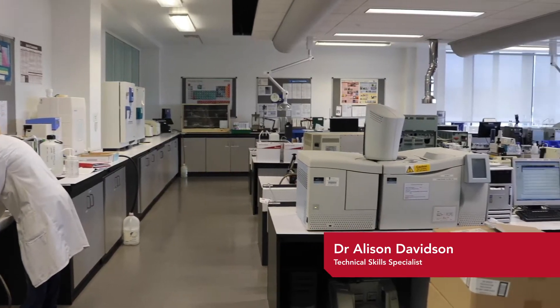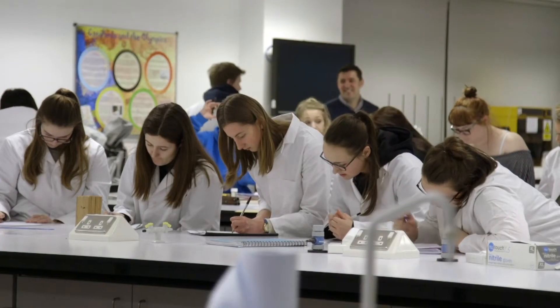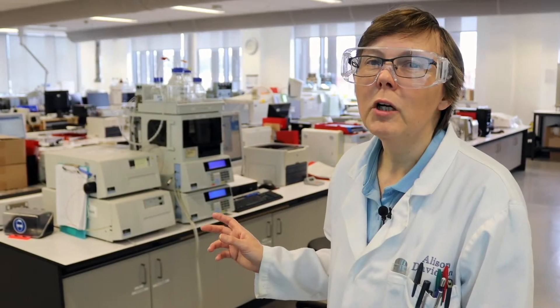Hi, I'm Dr. Alison Davidson. Welcome to our analytical methods laboratory. This laboratory is here for all our students at the University, but is especially used by our forensic science students. Let me show you some of the equipment that we've got in here — this is equipment that we'll get you working on right from your first year and even your first weeks at the University.